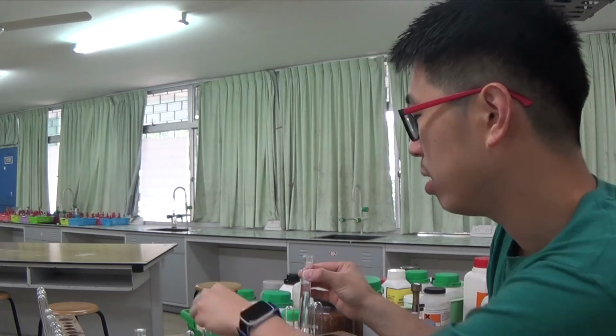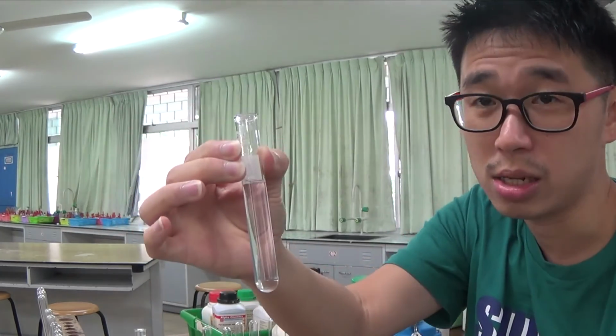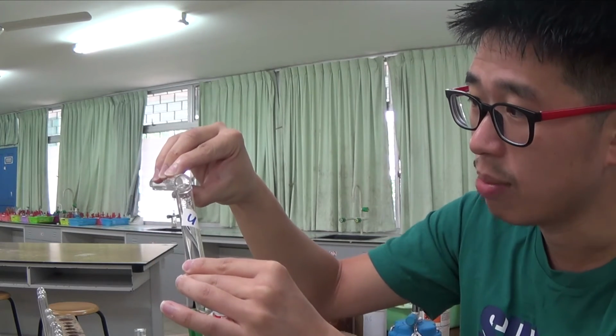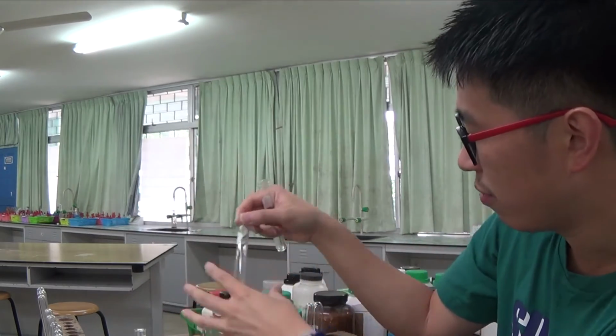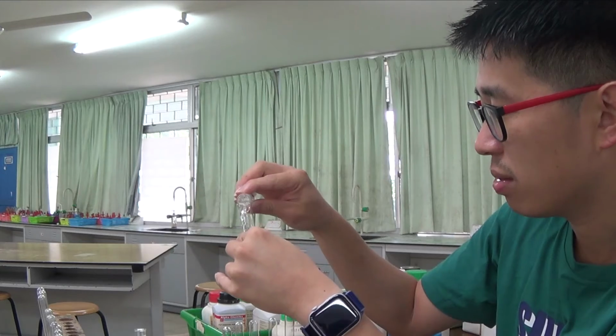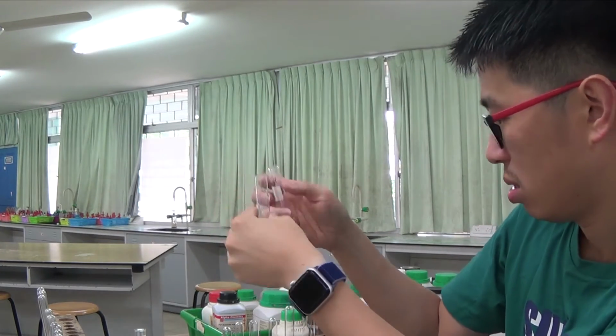So I did say I wasn't going to heat anything anymore, but I do still need to heat it. In instructions, they will usually ask you to separate into however many portions. So I'm going to test for several things. So this is aluminium ammonium sulfate. Oops, I don't want that too much. That's alright.